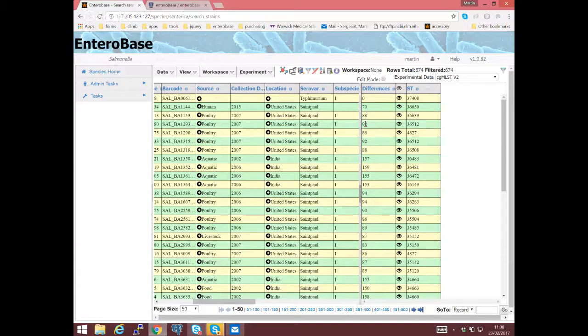We have a question, Martin. Yeah. Is it possible to add columns to metadata, e.g. in my own workspace? It will be in about a week. In a week? Yes. In a week. Okay, continue, please. Sorry.